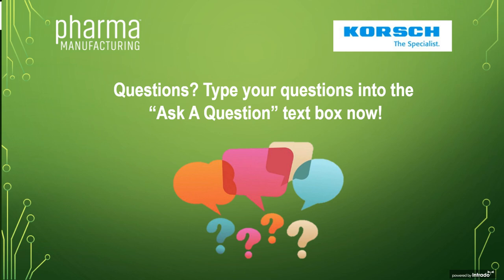Okay, good. Sounds good. We've got some more questions coming in. Someone is asking, how is drying accomplished after the WIP cycle?